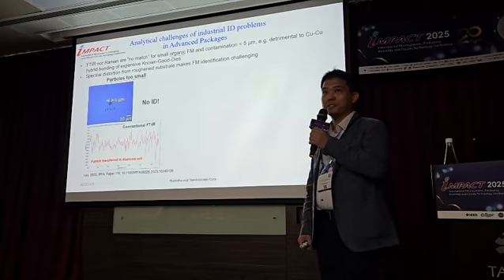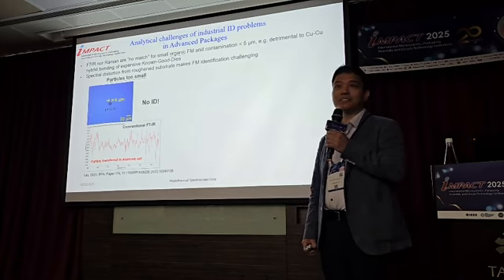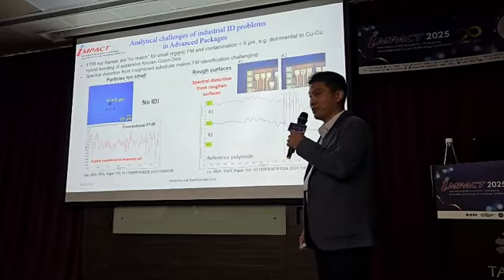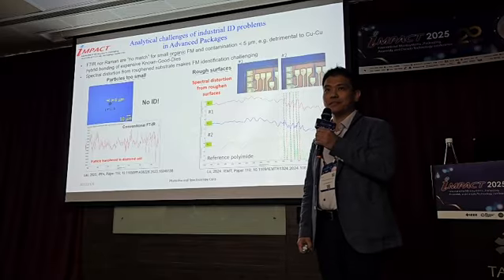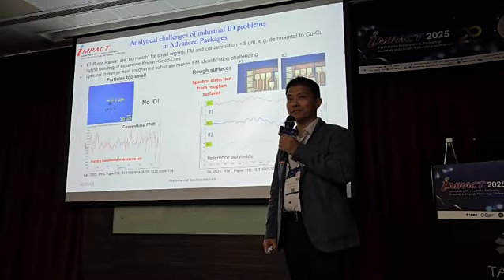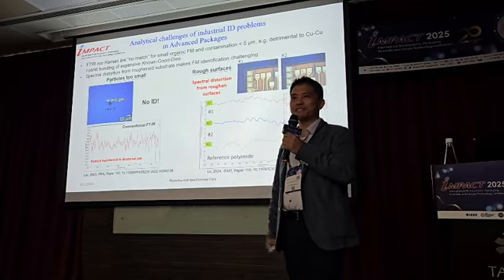You have a particle that's kind of small, less than 10 microns. If you're trying to analyze a particle like that with FTIR, well, chances are you probably won't get any result out of it. And to a certain extent, it's also true that when you have some contamination on the metal substrate like that along the rim, it might be actually challenging to find out what it is using reflection FTIR. In the past few decades, this is fairly a repeating theme of its own.